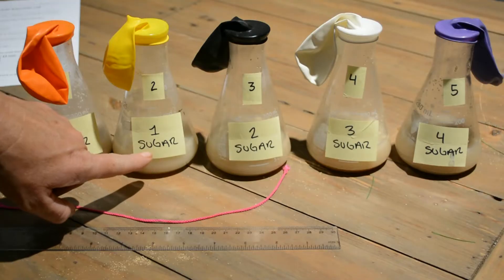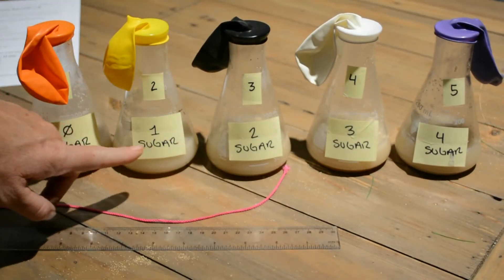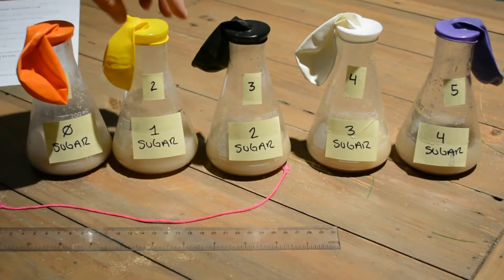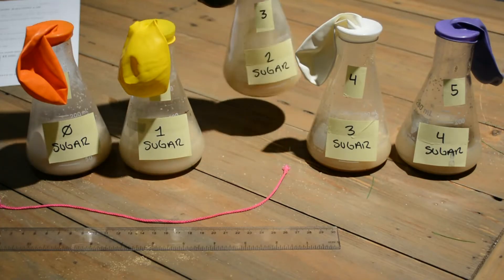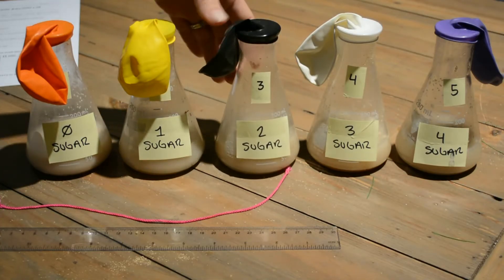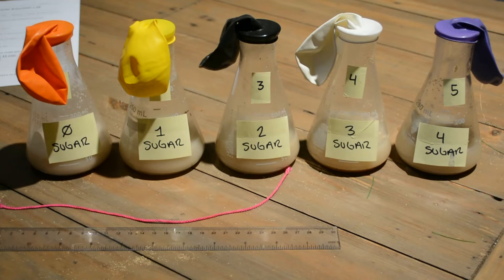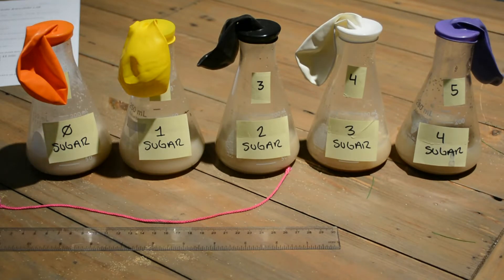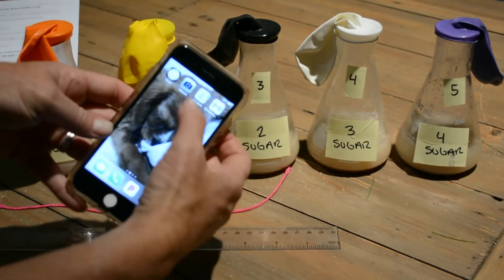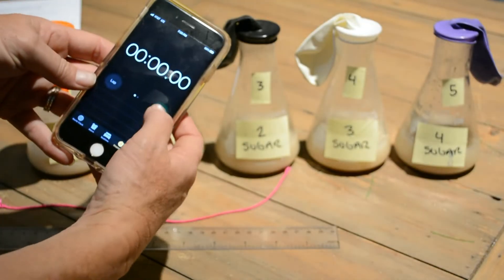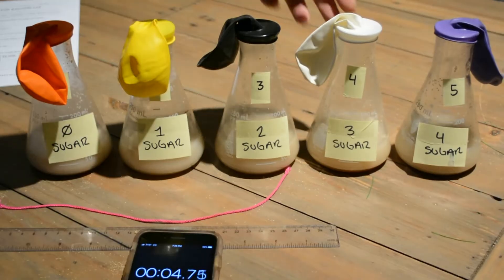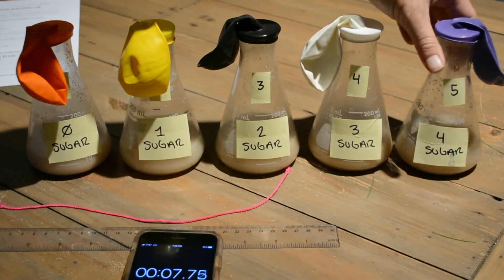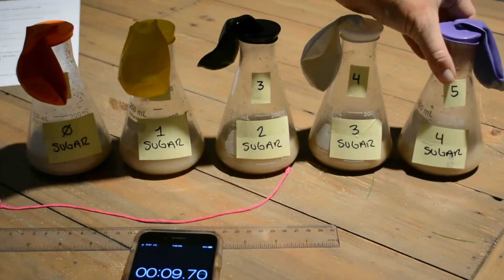The yeast breaks the sugar down into pyruvic acid, then into ethanol alcohol, and also produces a little bit of CO2 and ATP. Because CO2 is a gas, we are going to capture it in these balloons. While we're waiting, I'm setting a timer on my phone — we'll wait five minutes and then start recording how much CO2 is getting captured inside the balloons.